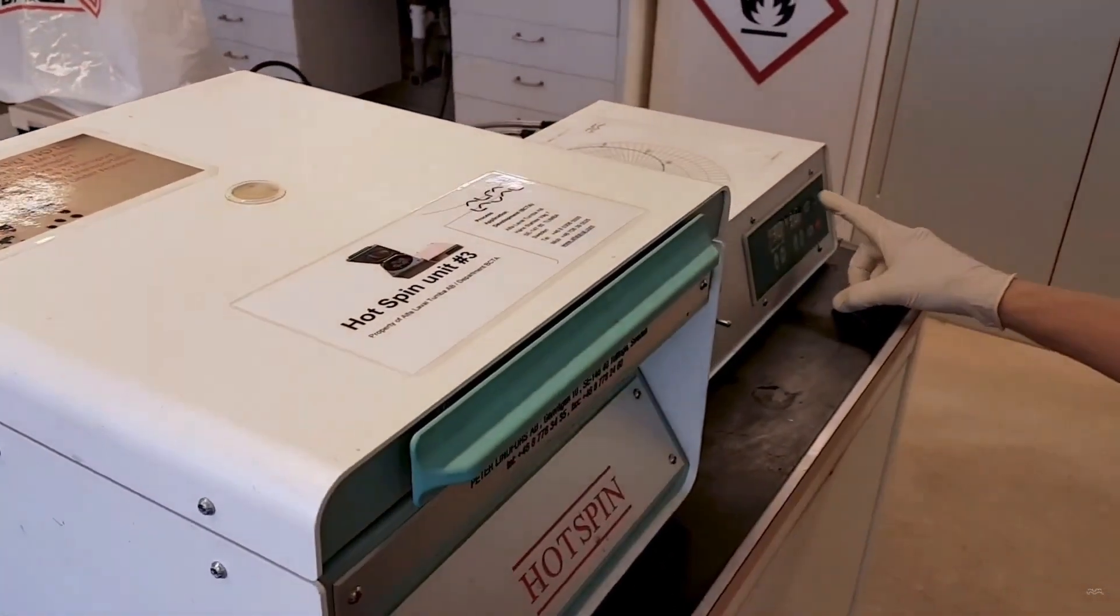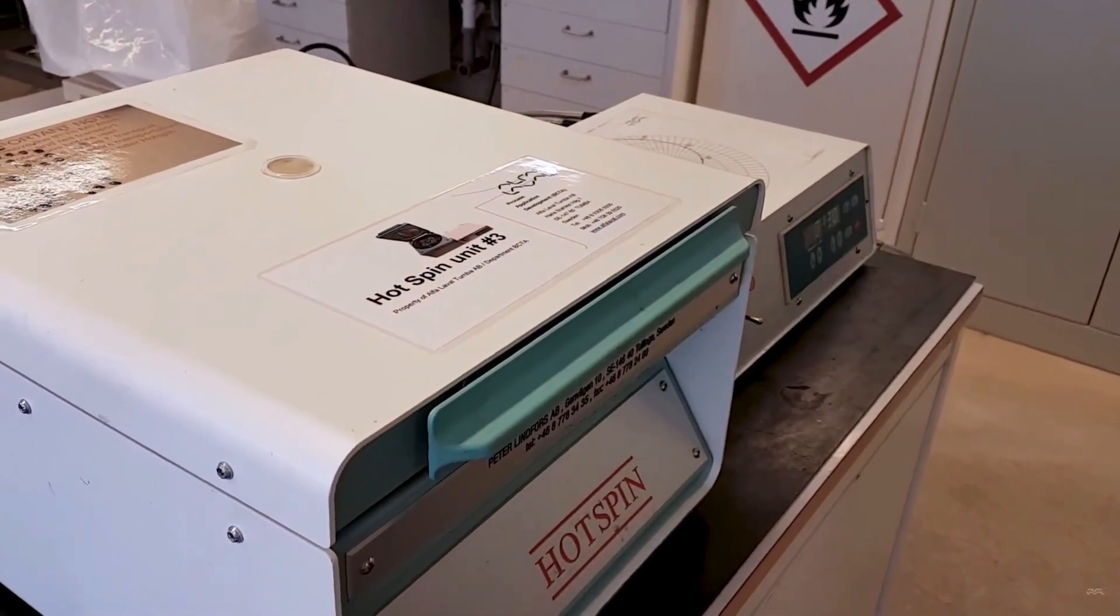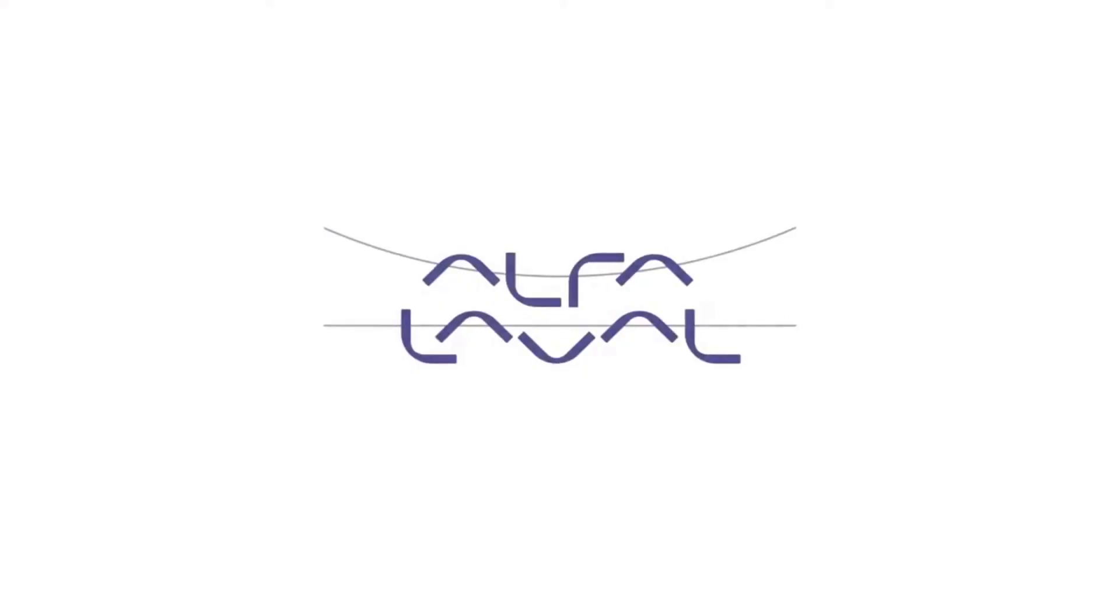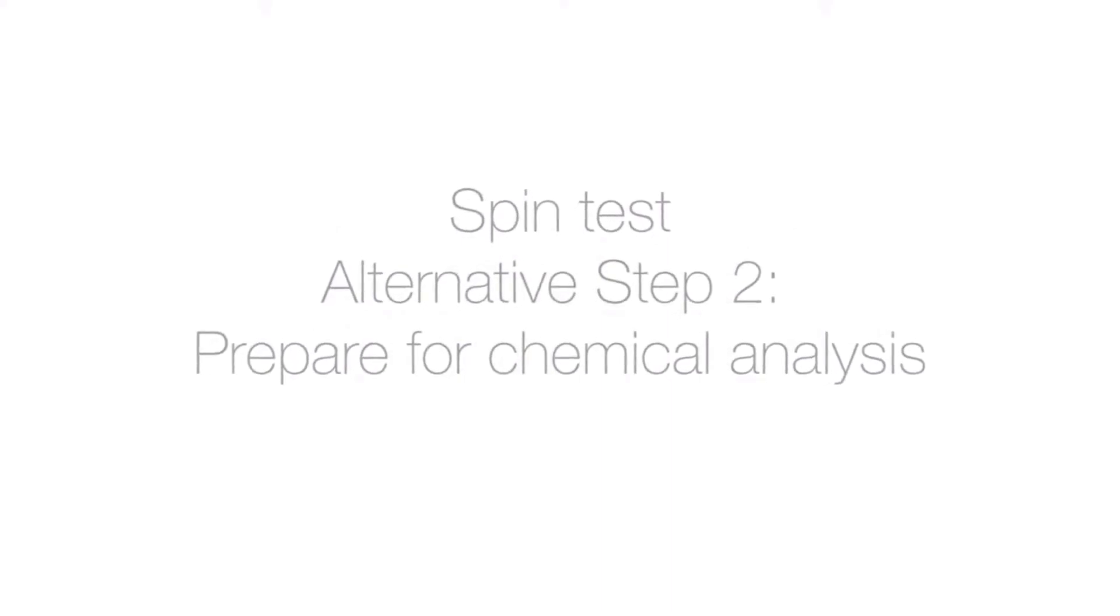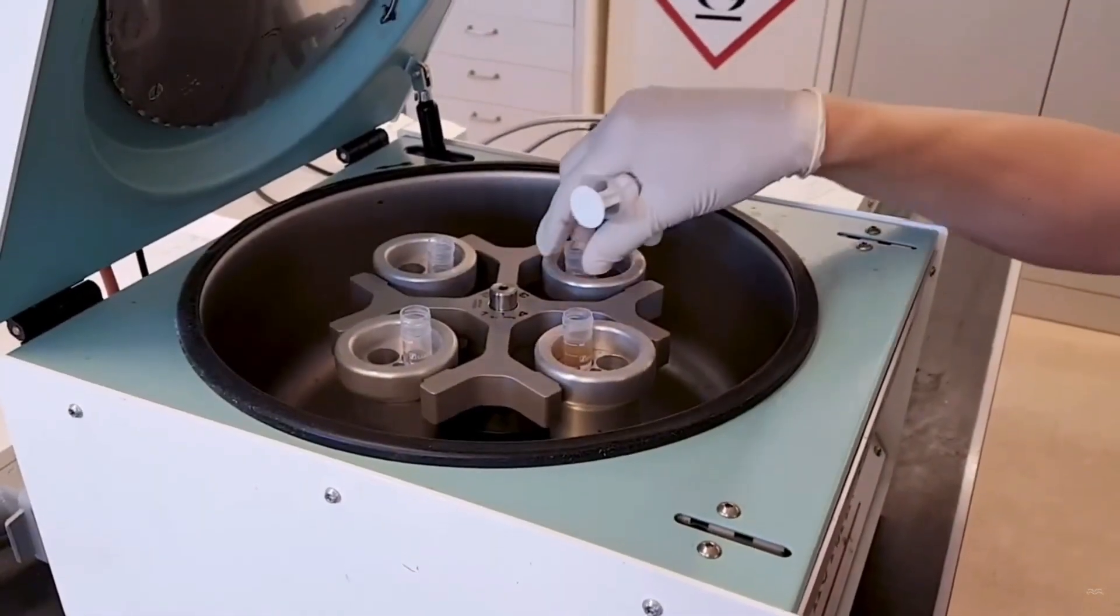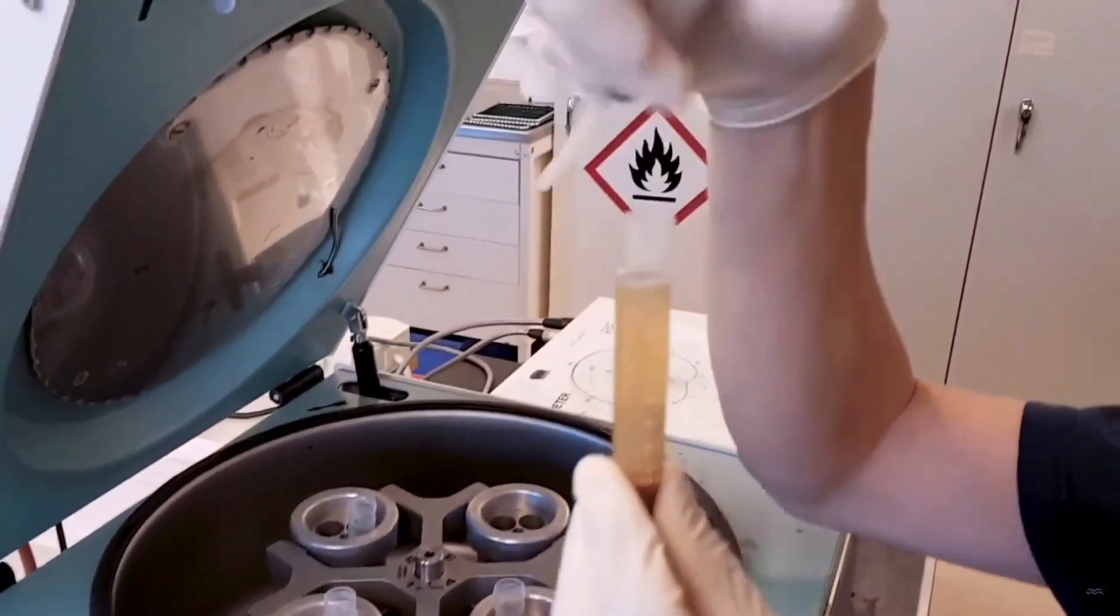Once the spinning is concluded it is time to prepare the sample for analysis so we can evaluate the separation results from the lab scale. At first take one vial and check the overall appearance. There should be a more transparent solution on the top.